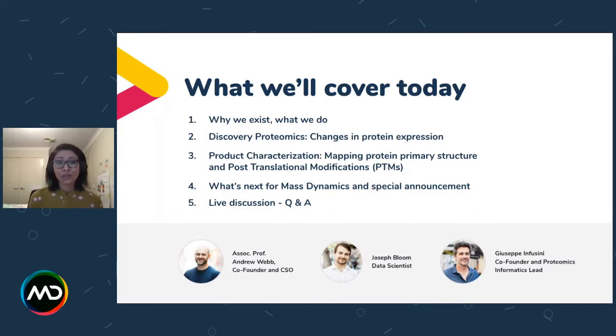We're then going to dive into each of the proteomics applications we offer. So we've got Joseph Bloom, one of our talented data scientists, and he's going to walk us through our discovery service and showcase how we deliver differential expression analysis. And then Giuseppe Infusini, one of our co-founders and our proteomics informatics lead, will take us through product characterizations to services, peptide mapping, and quality attribute monitoring.